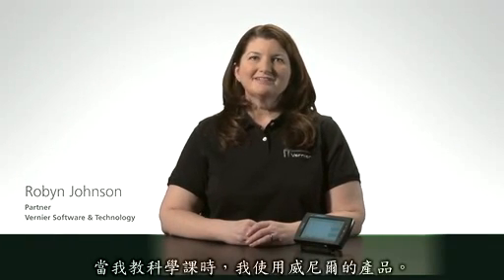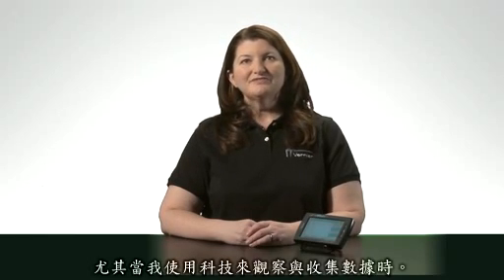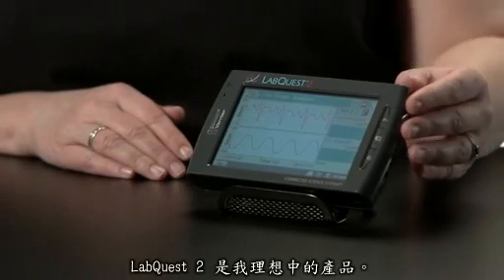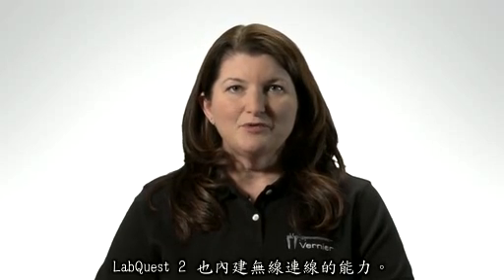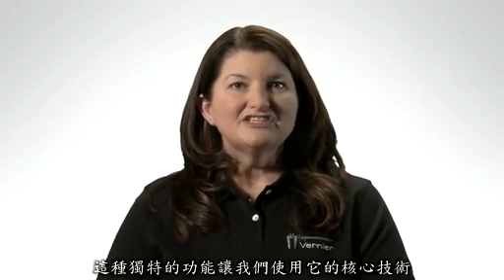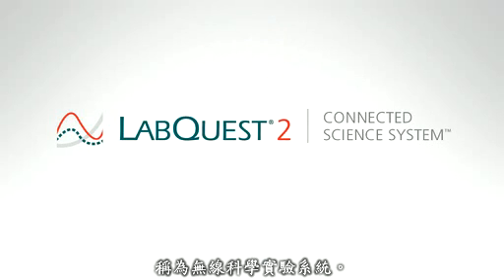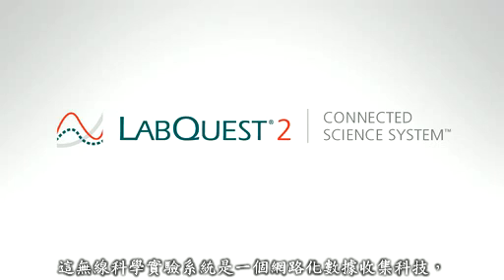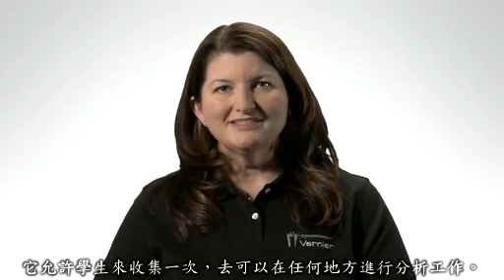I'm Robin Johnson, and when I was teaching science, I used Vernier products. I found that my students were always more engaged in their learning when using technology to investigate and collect real data. LabQuest 2 is ideal for this. In addition to being a robust data collection device, LabQuest 2 has built-in wireless connectivity. This unique feature makes it the heart of what we're calling the connected science system — a networked collection of technologies that support data sharing and collaboration in new and unprecedented ways. It allows students to collect once, analyze anywhere.